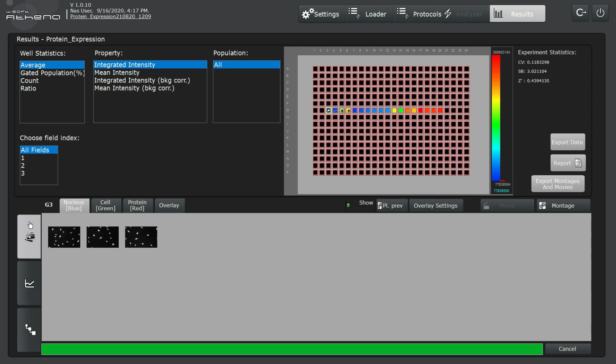First, I will describe navigation within the Image Explorer tab. Then I will demonstrate how we can interact with the images themselves to create colored RGB overlay images from the black and white grayscale raw images, as well as how to create an image to visualize plate-wide signal changes.